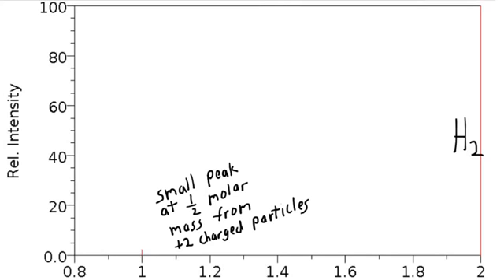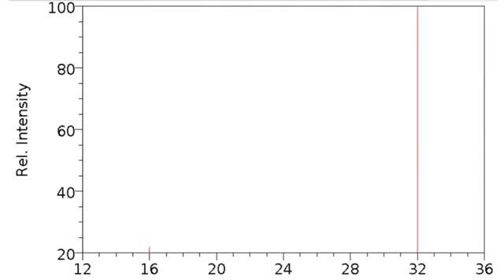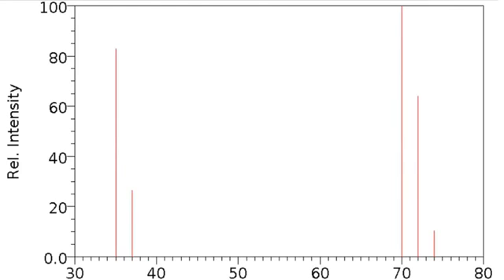But if there are more abundant different isotopes, you see other peaks, like in our next example. Let's look at this one. We see a big peak at 32, very small peak at 16. So what would that be? Well, again, this is 32 divided by +2. And then this one would be O2. So you look at the mass of the major peaks and you figure out what they're made out of based on the masses. Here's a more interesting one.